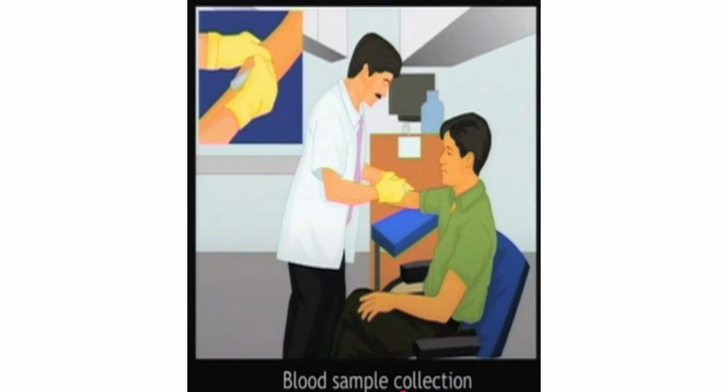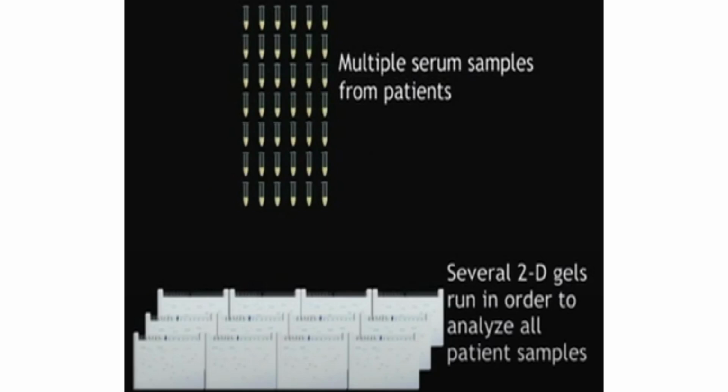Initially, for example, sir gave an example where blood samples are collected, then their serum is separated. So there will be multiple patients and multiple serum samples, and then multiple gels will be run on those samples. You collect the blood samples, separate plasma and serum, and only serum samples are collected. Depending upon your experiment, you can do anything basically. In serum, there will be a certain amount of abundant proteins which we generally know.